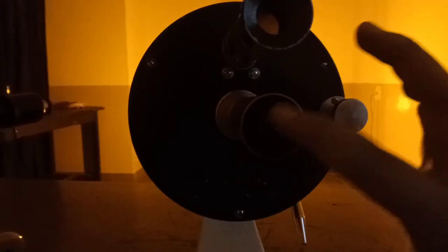Place the tube inside this and close it. And this tube, at first I have filled it with distilled water, and as we proceed in the experiment we will be replacing the distilled water by sugar solution of varying concentration. So here you have the eyepiece, and there will be a Nichols prism after the sugar solution tube. When you rotate that Nichols prism, in the eyepiece you will have a central division line, and the light on both sides of that will be of varying intensities.